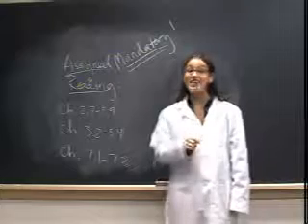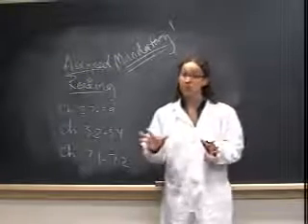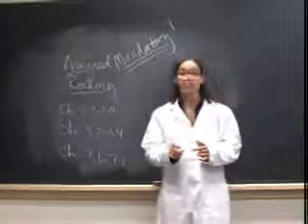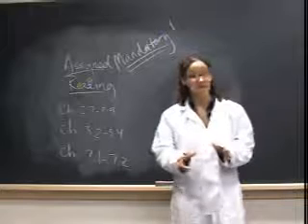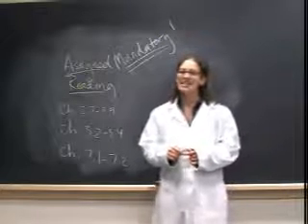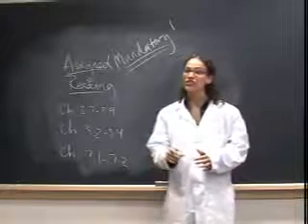Remember, this video is intended to help you prepare for lab by providing a demonstration of the proper experimental technique. It is not intended as a replacement for reading your lab manual or the supplementary material. In order to become a great experimentalist, it is important that you understand both theory and technique. Now it's your turn. Good luck.